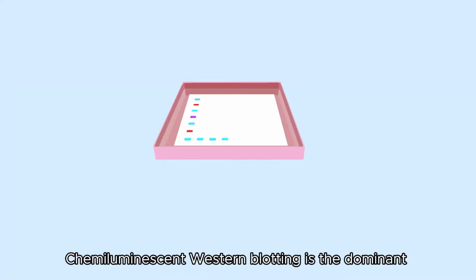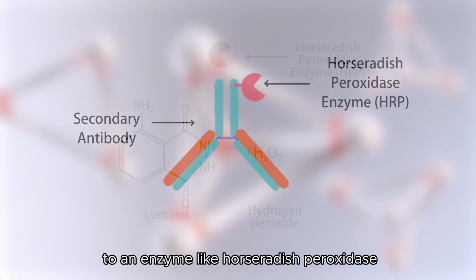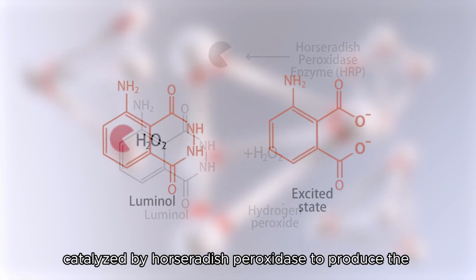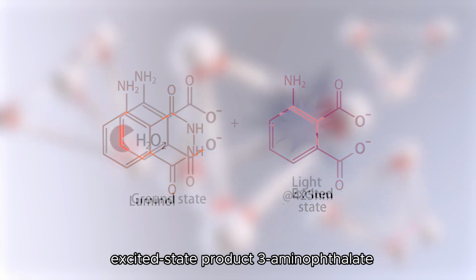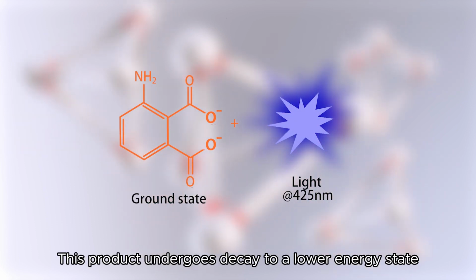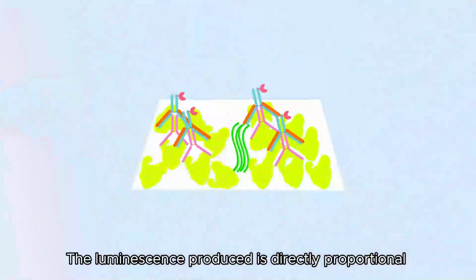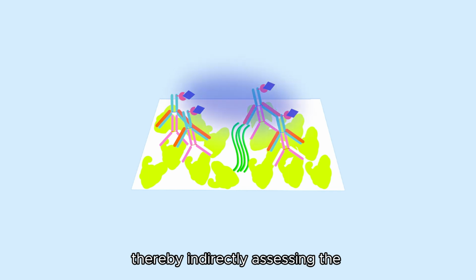Chemiluminescent Western blotting is the dominant method for protein detection, with the secondary antibody typically linked to an enzyme like horseradish peroxidase. The preferred substrates use luminol and hydrogen peroxide, catalyzed by horseradish peroxidase, to produce the excited state product 3-aminophthalate. This product undergoes decay to a lower energy state, emitting light photons at 425 nanometers. The luminescence produced is directly proportional to the quantity of the horseradish peroxidase conjugated secondary antibody, thereby indirectly assessing the presence of the target protein.